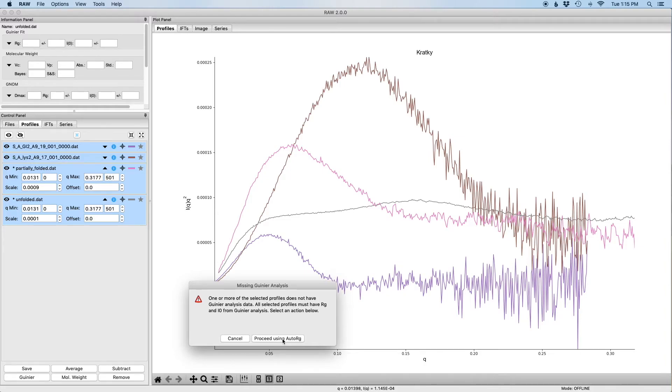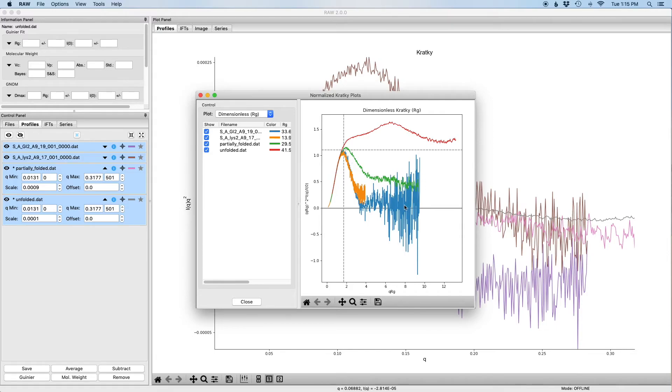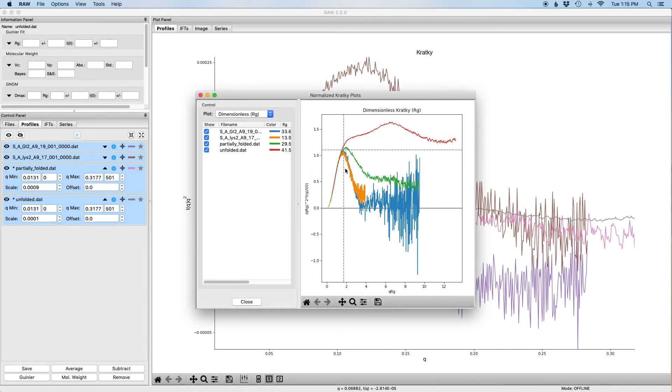And now the normalized Kratky window opens. So in this window we see two main regions: there's the plot on the right then there's the control and information panel on the left.